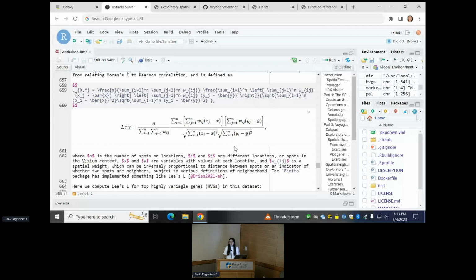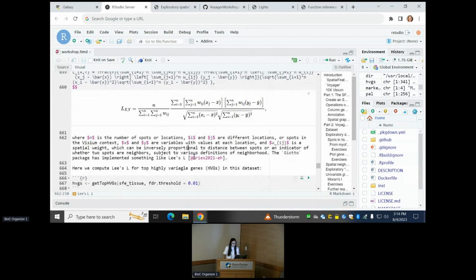You have the graph, and from the graph you can compute different kinds of edge weights. Actually, for this one it's not a kernel. It's a spatial network graph. Just now, when I was talking about colGraphs, there are different ways to find this graph, and also different ways to compute the edge weights. Okay, so that can be calculated. Yeah.